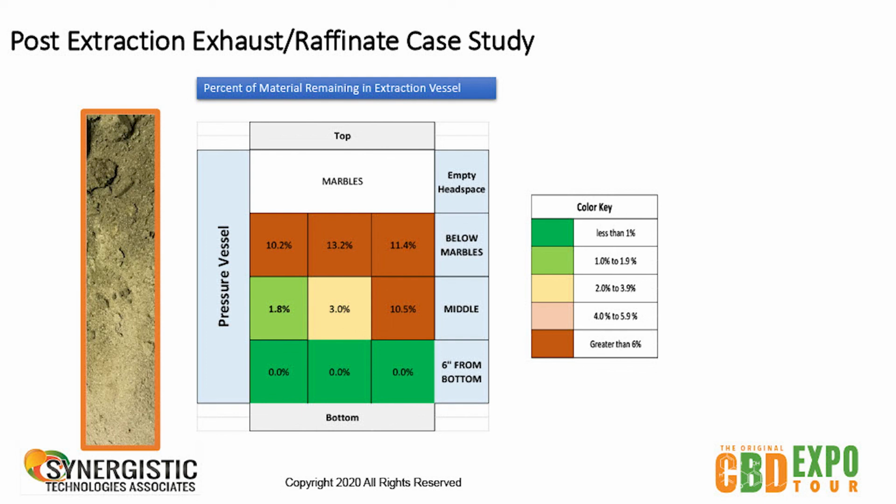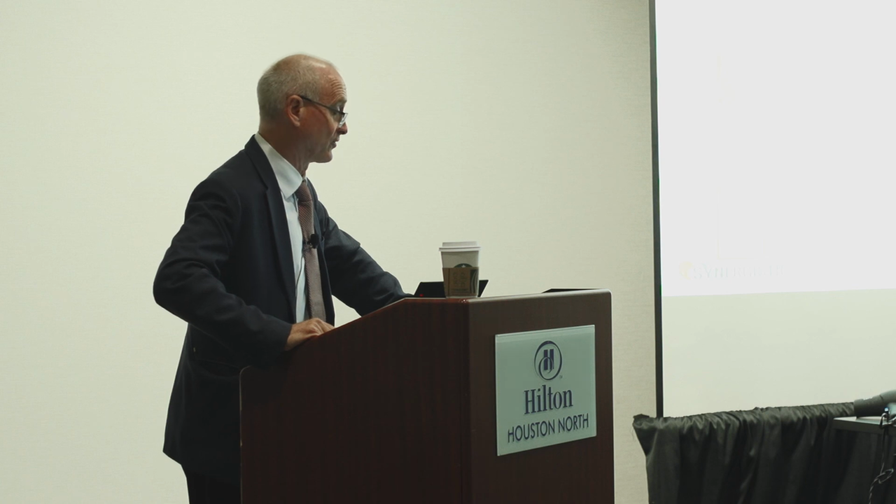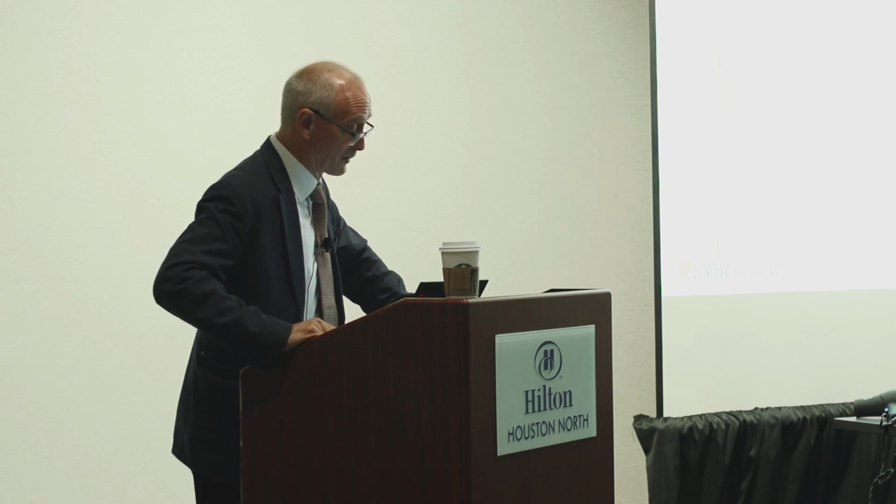If I'm looking at those same numbers that we see there on the left-hand side with the difference in color, I've measured 9 different places within that. So across the bottom, you can see, like the picture shows, that it has been extracted, and there's not much left. It says 0, but maybe it's a little above 0.